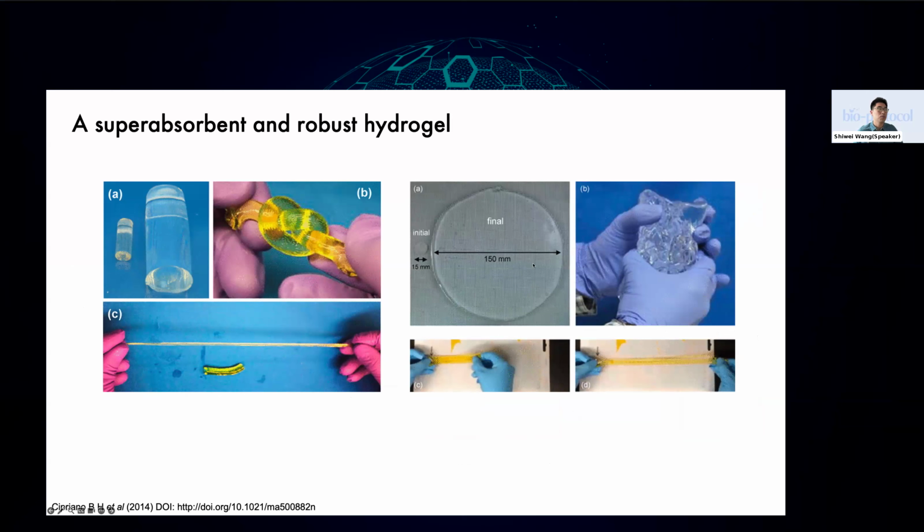And it's also mechanically robust, meaning that they can stretch it to a very extreme degree and the polymer will remain consistent. So that's very promising to us, that this particular polymer can be used to develop the next generation gel system for expansion. And this polymer has been used in a previous expansion protocol called the X10 protocol from the Rizzoli lab. But when we looked at the paper, they didn't really optimize the polymer part. And we think that we could push this further by optimizing the polymer composition.